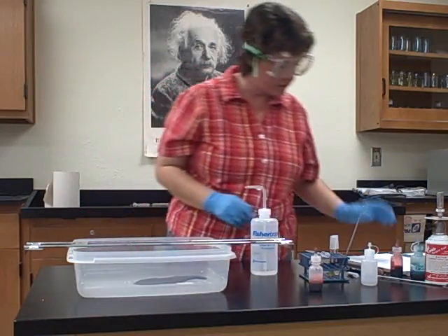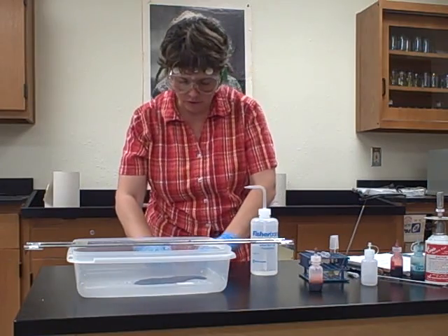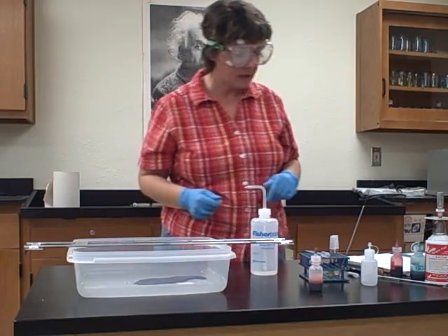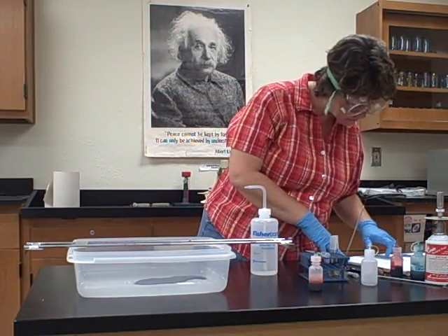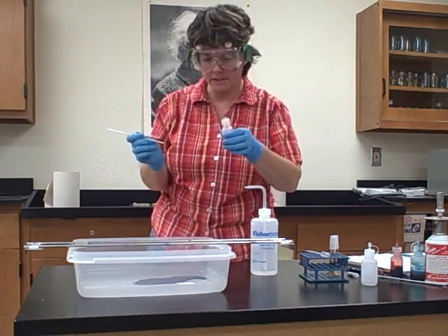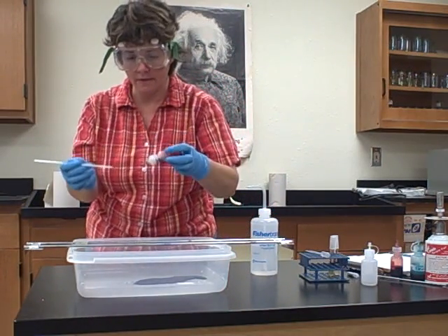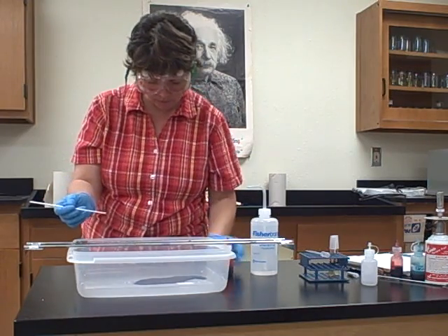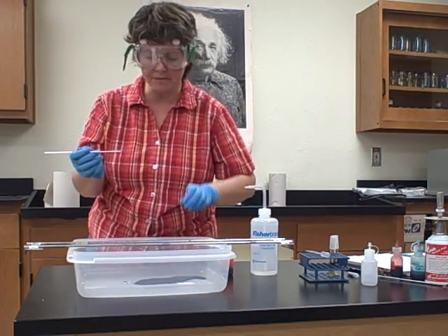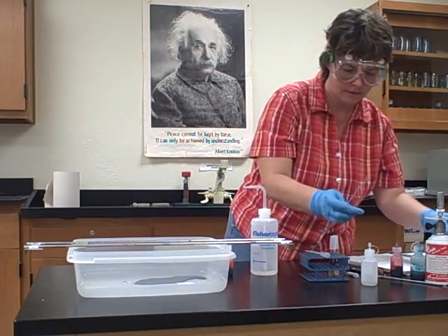Okay? So the first thing in this procedure, we're on page 49, the second procedure, it says to draw 2 circles, and I've already done that. That's only because we're using 2 different bacteria. And then it says add a loop full of Congo red. I've already sterilized this, so I'm going to skip that sterilization step, but you would have sterilized it first. So now I'm going to take this and put a loop full of Congo red. It says in each of those circles, but I'm just going to do one just to save supplies. Now I have this dirty, so I need to sterilize it.